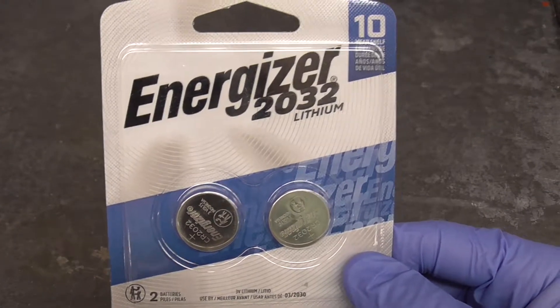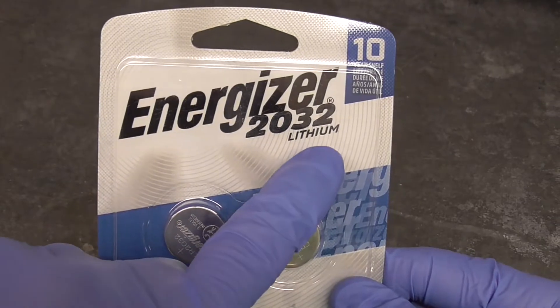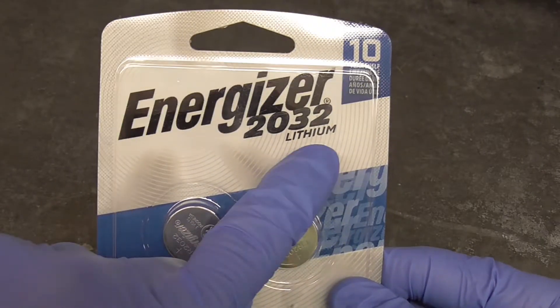Many button batteries or coin batteries, like the ones you see here, contain the metal lithium. I decided to see if I could extract the lithium from batteries and do some experiments with it.